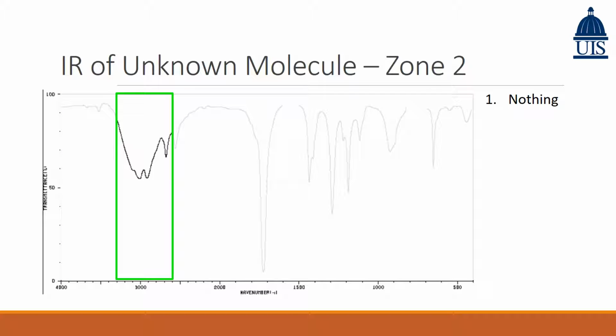All right, now we have this jagged kind of beard shape, okay? And there are 2 things to look at when you're looking at infrared spectroscopy. The first is the position. What zone are you going to be in? And the second is looking at the shape.